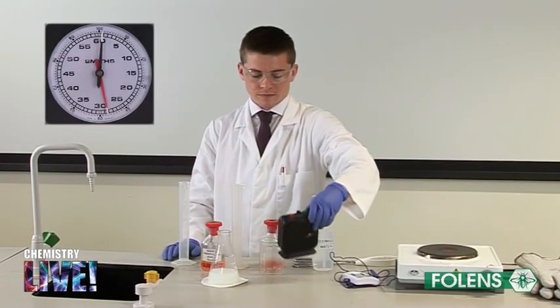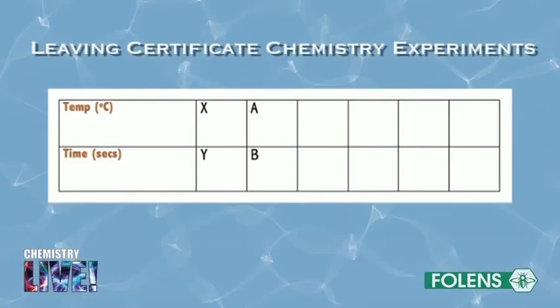As in the previous experiment, measure the temperature of the mixture and enter the data at A and B marked on the table.